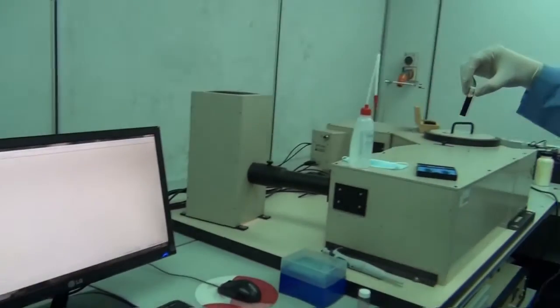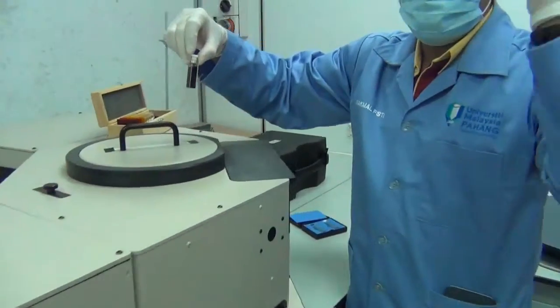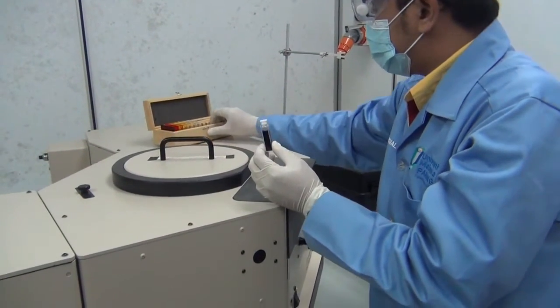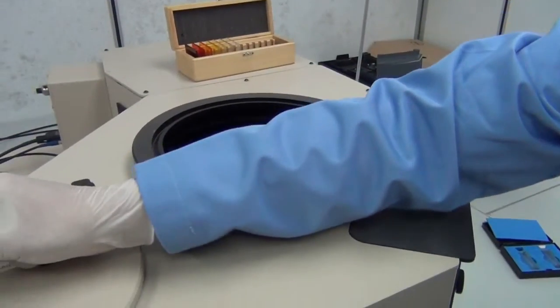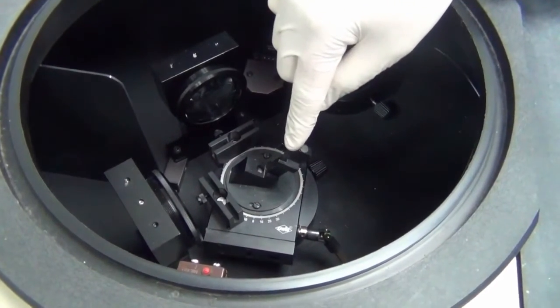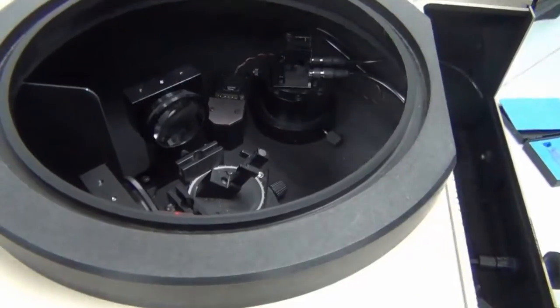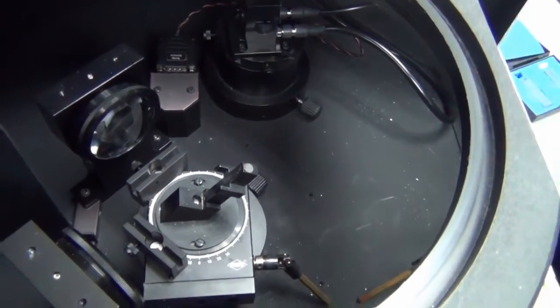Now, put your sample in the sample compartment chamber. Always put your glasses, your goggles on. This is the sample compartment chamber. Take it out. And unfortunately, somebody already used this sample stage. This is not the sample stage for liquid. We need to change the sample stage. Okay, let me change the sample stage for you.